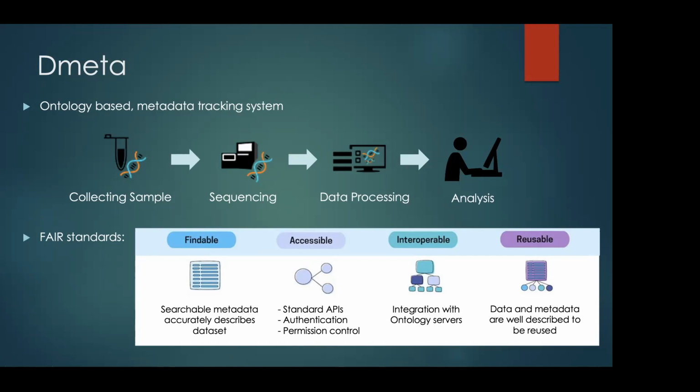You won't see RNA-seq without the dash in those data, so they'll all be collected. When you don't have this kind of system, other people usually work a lot just to fix these problems. So we are trying to make things more efficient here.